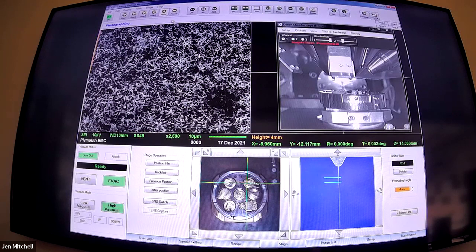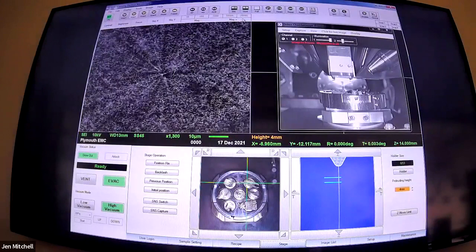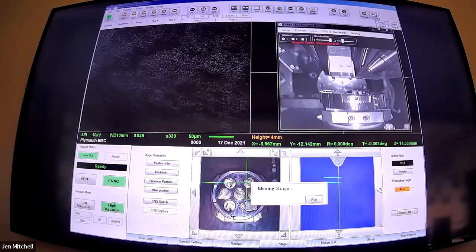I've got two more things to look at - one's in a similar vein to this, not too far apart from each other. So that was pine leaves. We also have pine cone, or at least one of the little fronds of the pine cone - let's drive over. I'll zoom out so you can see it, and turn the brightness up.